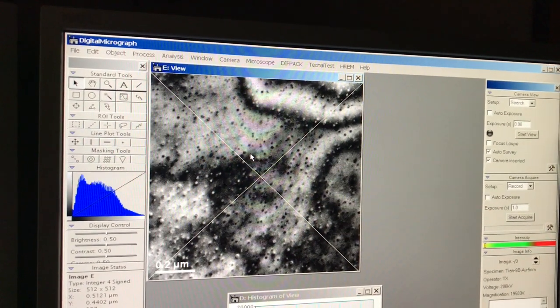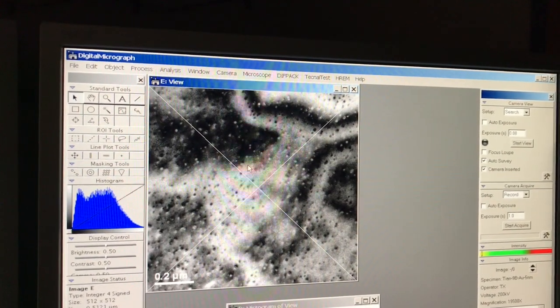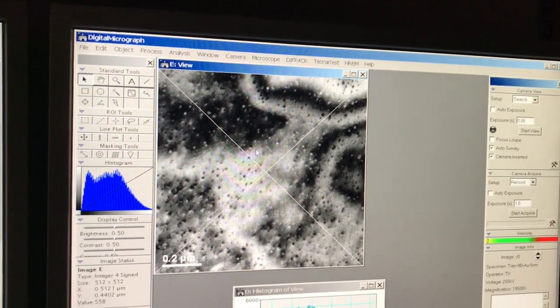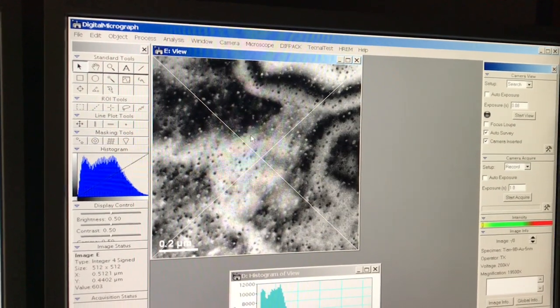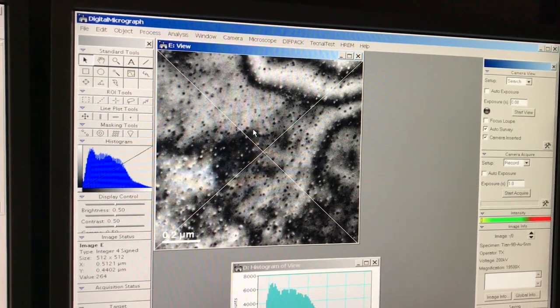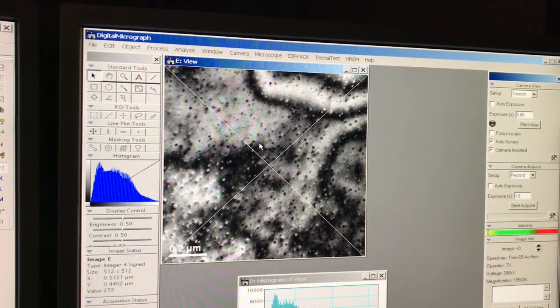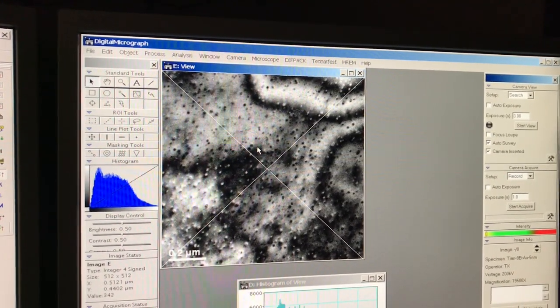So I have a contrast reversal when I do this. What's bright in the bright field becomes dark in the dark field, and vice versa. So the CDF image really isn't any more beneficial in terms of the contrast that I get. I don't have what's known as sharp contrast, meaning it's hard to delineate the faulted regions from the non-defective region of the material.